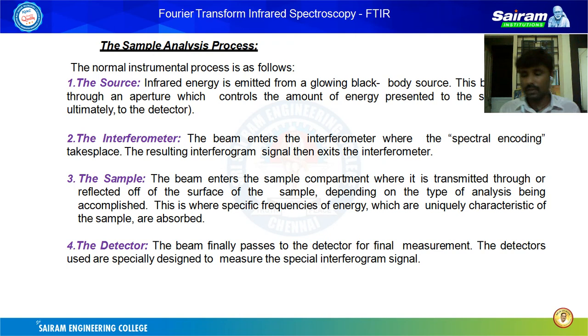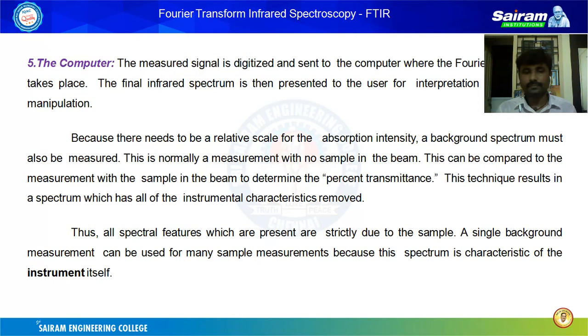The last one is the computer. The computer is used to perform the calculation of the Fourier transform with the help of algorithms. The final infrared spectrum is then presented to the user for interpretation as well as for manipulation.